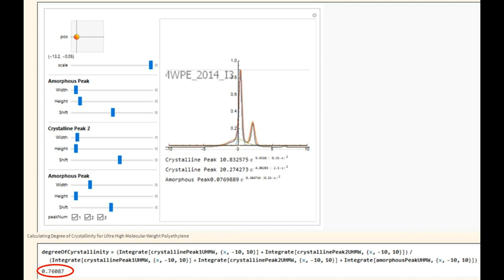In all three polymer case studies, this code obtained a degree of crystallinity value within the acceptable range, indicating manual Mathematica peak fitting of XRD plots is a reasonable way to determine a material's degree of crystallinity.